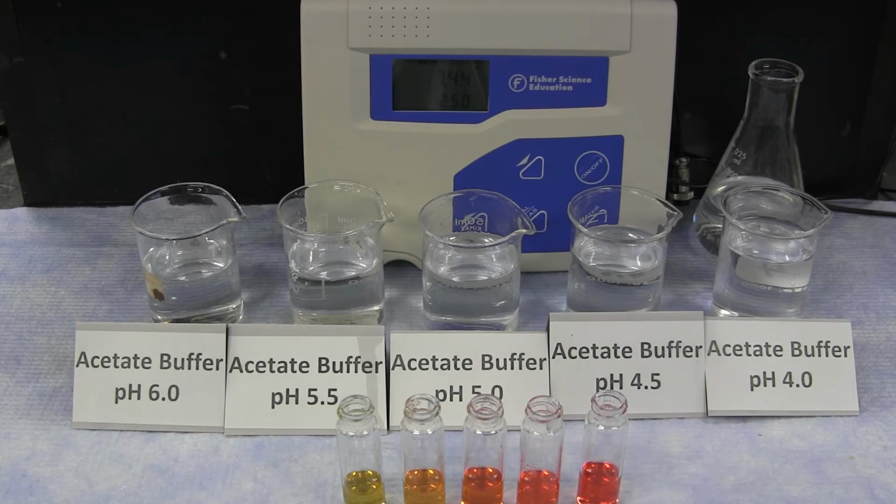or base interference. These buffers play a critical role in a lot of biological processes, as many enzymes and proteins will only work at very specific pHs.